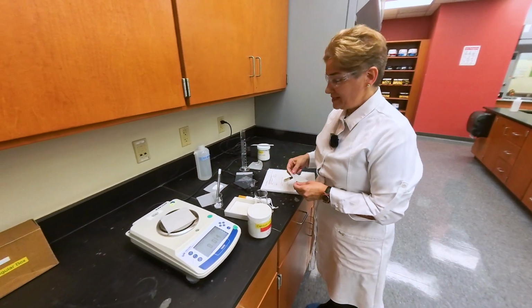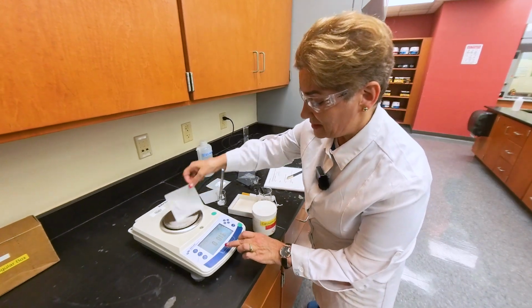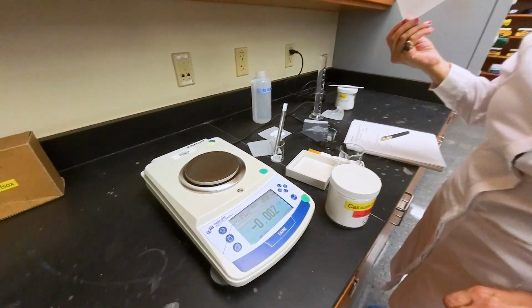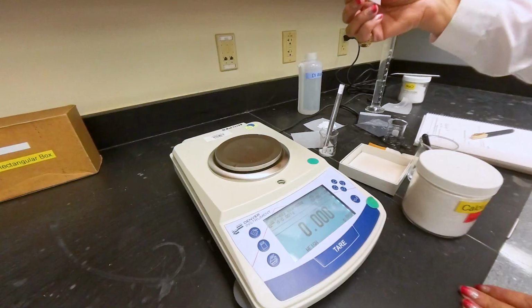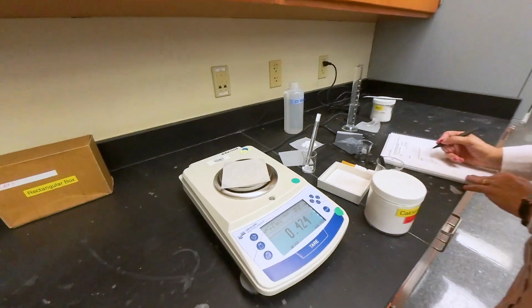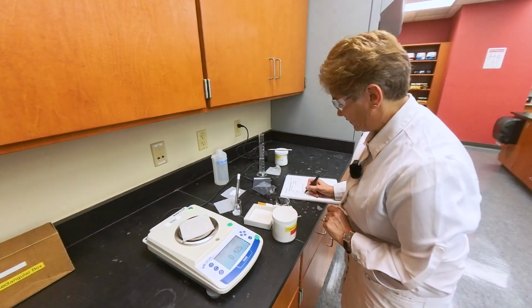And because it's the mass by difference, I need to get the mass of the weighing paper itself first. So I have to tare the scale. Okay, I place the weighing paper on the scale. I get the mass of the weighing paper first, and I record that as mass of the weighing paper.